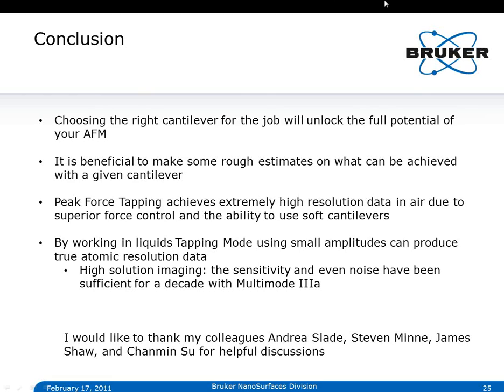Well, you calculate the force using Hooke's law. Like I showed you in the force curve at the bottom, the difference between your baseline, when the cantilever is not deflected, and the lowest point before the cantilever leaves the surface is the adhesion force. If you know the spring constant, which you can of course calibrate and should calibrate if you want to know the exact force, then you can easily calculate the force that was required to overcome that adhesion.